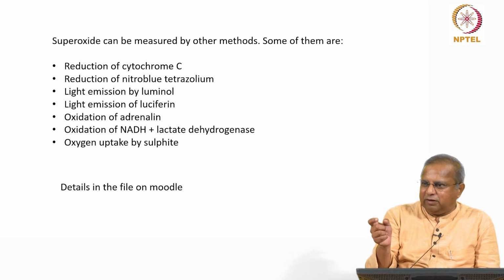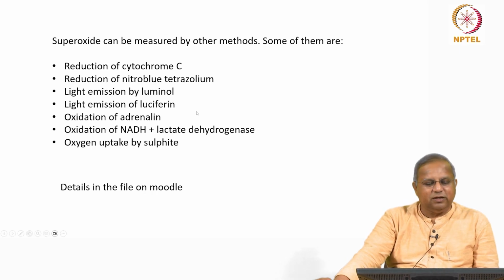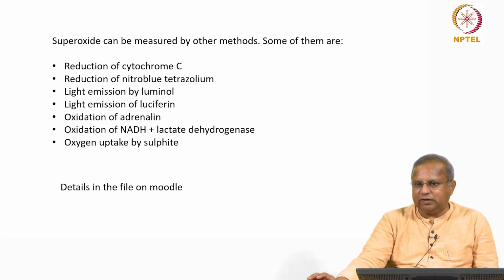I think the table goes as generation of superoxide, more for the standard curves kind of a thing. But the detection methods are the same also. So take a look at that. Use whatever is appropriate for your needs. So all these are available. Be aware that many methods are available. I discussed in detail only the ones that we use in our lab. That's a given thing. Any questions or comments?